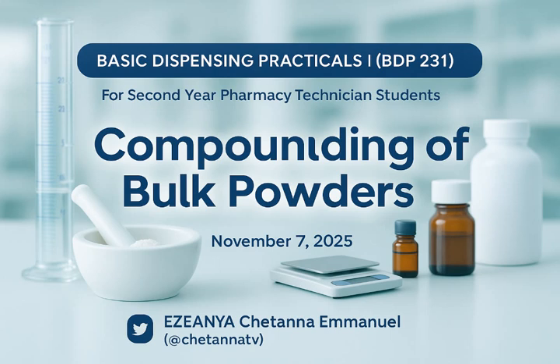Overage is the surplus quantity of each of the ingredients you add, so as to be able to get the exact amount, and to avoid shortening the amount of the product due to losses from transference loss or sticking to the walls of the container or the mortar you use in mixing.